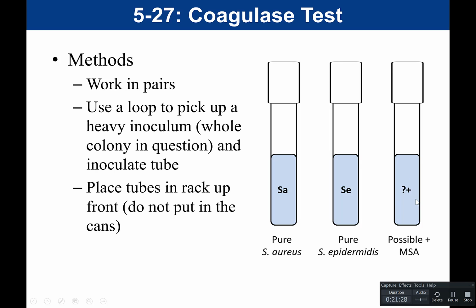And then after 48 hours, we would see if it turned solid. If it turned solid, that would be confirmatory that the colonies that formed the yellow agar were in fact Staph aureus. And so the coagulase would be our confirmatory test, because Staph aureus and Staph epidermidis, as well as other types of skin bacteria, will grow on MSA. But we're looking for Staph aureus specifically.